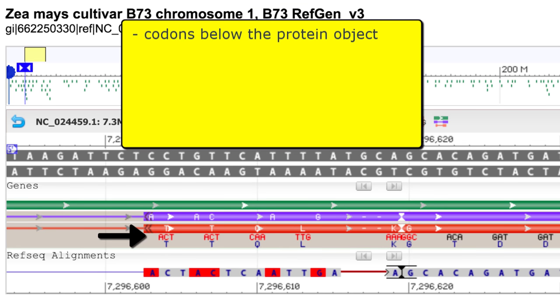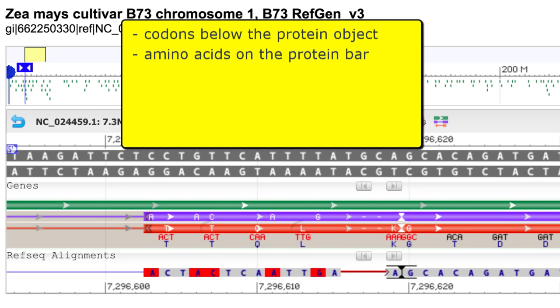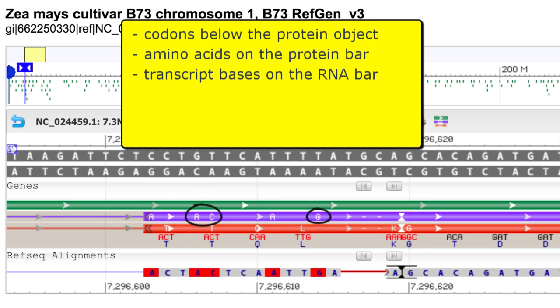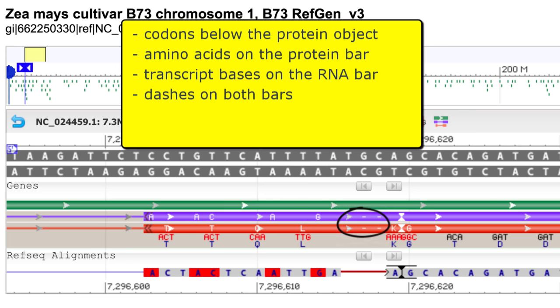If red, there is a mismatch in one of the three bases. Red codons could represent either synonymous or non-synonymous amino acid changes. Amino acid single-letter codes on the protein—the red bar—are present only when the amino acid is changed. Transcript bases on the RNA—the purple bar—display only when the transcript sequence differs from the genomic. Dashes on the RNA and protein bars represent deletions relative to the genomic sequence.